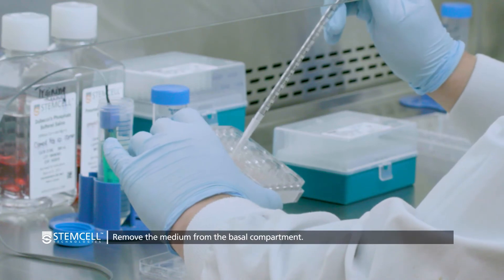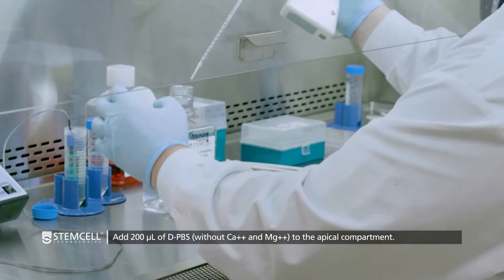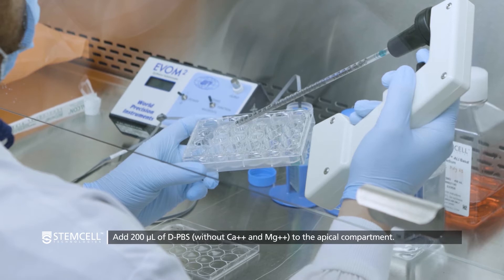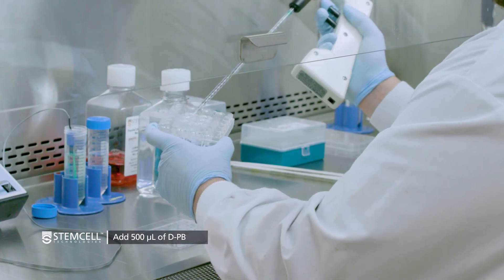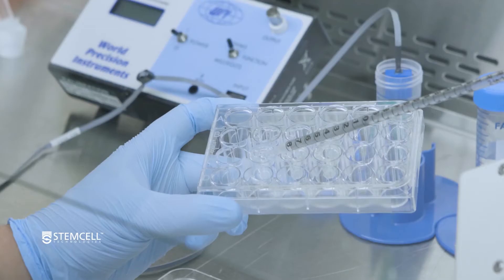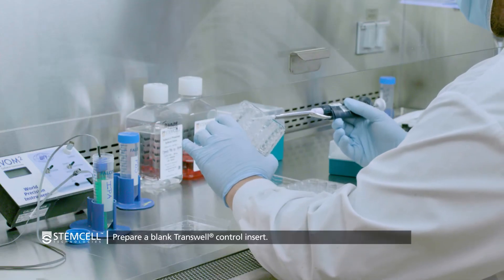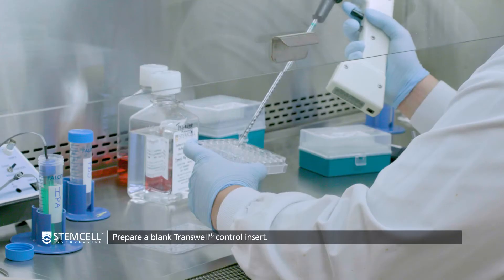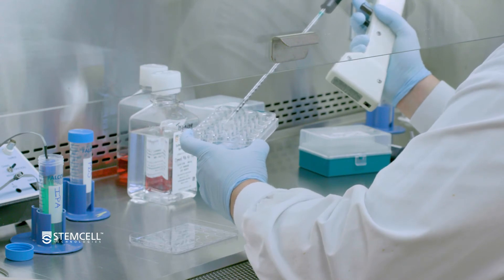In the meantime, prepare the ALI cultures by removing the medium from the basal compartment. Add 200 microliters of calcium and magnesium-free PBS to the apical compartment, and 500 microliters of PBS to the basal compartment. For best results, complete your ALI culture preparation just before probe sterilization is complete, within 1-2 minutes. Also prepare a blank transwell control by adding 200 microliters of PBS to the apical compartment and 500 microliters of PBS to the basal compartment of an unused transwell.